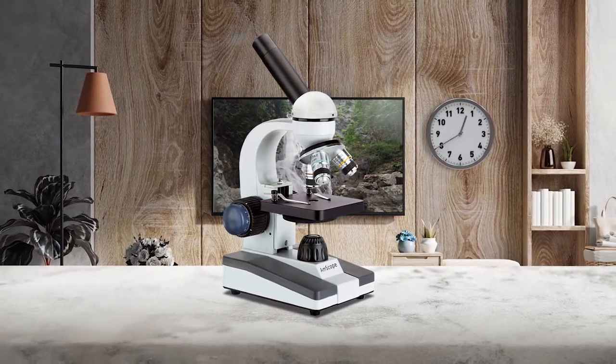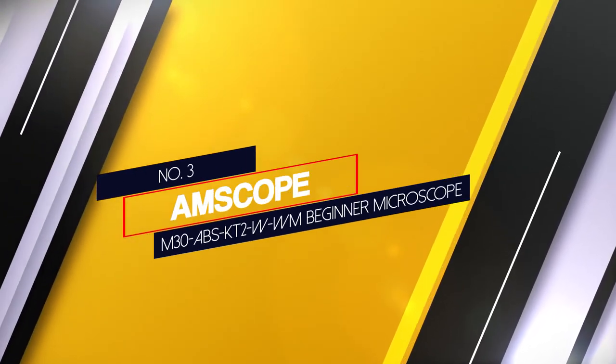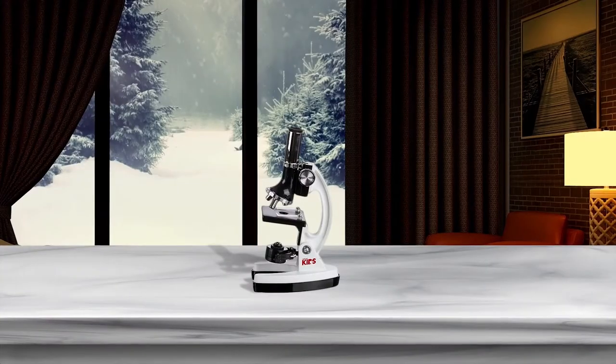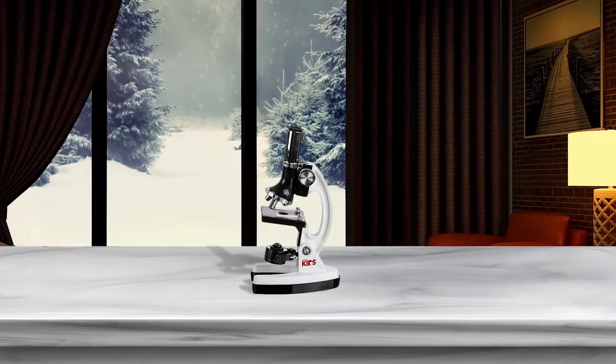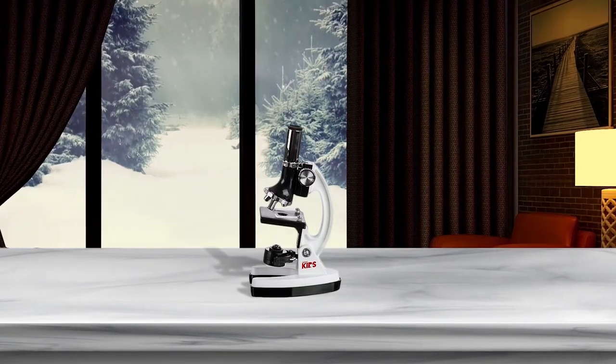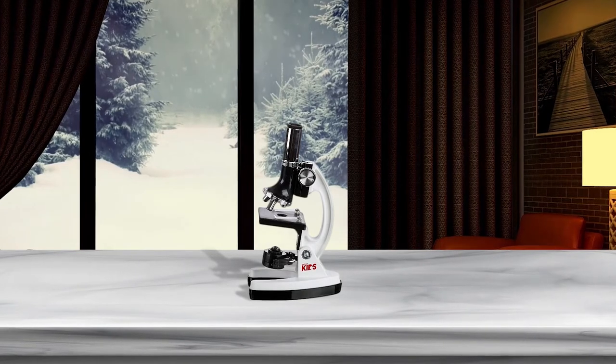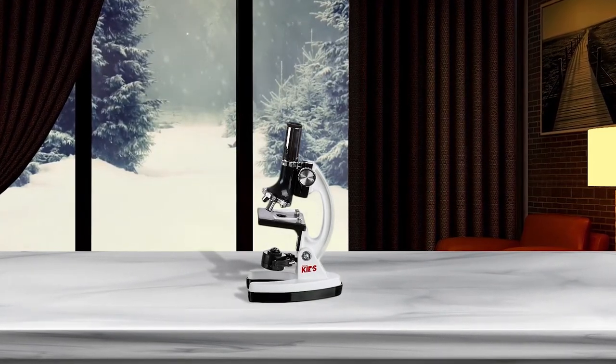It also comes at an affordable price. Number 3: AMscope M30 ABS KT2WWM Beginner Microscope. It is one of the best microscopes for beginners and best suitable for students. It provides up to 1200 times magnification. Students can view objects like cell structure, nucleus, leaves, and it is suitable for dissection.